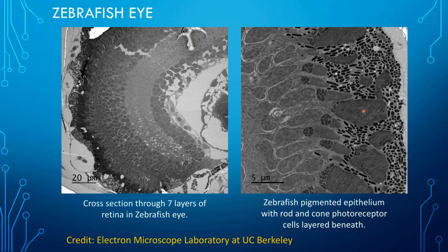And so here are some rods and cones of the zebrafish eye structure. It's flipped from its orientation over here, just a heads up on that. So here you can see the pigmentation granules within the cone cells. And so the rods have their photoreceptor layer, lamina sheets here. The membrane and the nuclei are here below, and so you really get this nice organization view, and you could go in and start to do some measurements of these cells and look at how they're arranged.